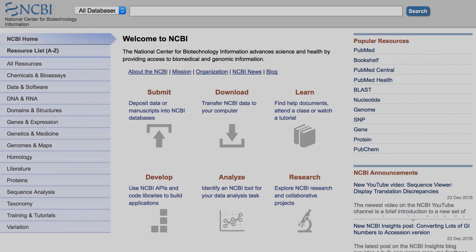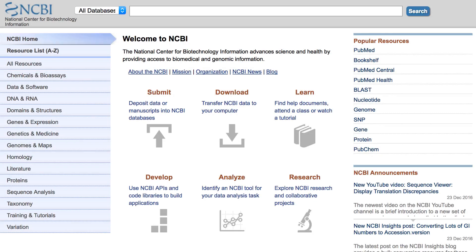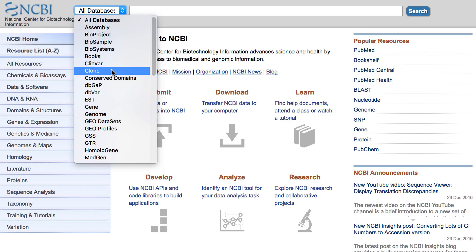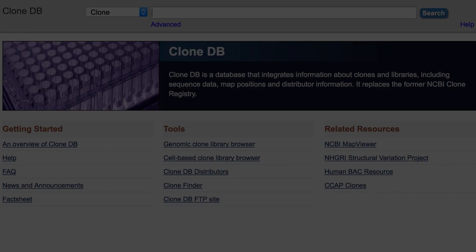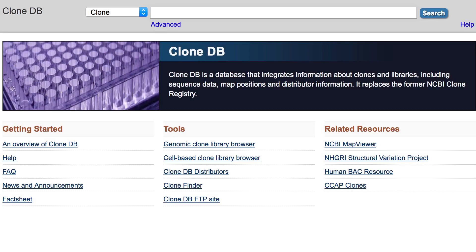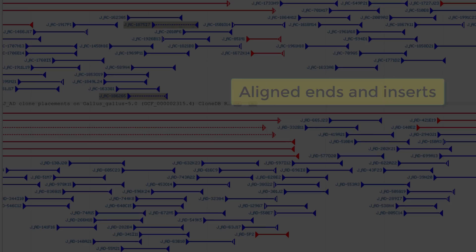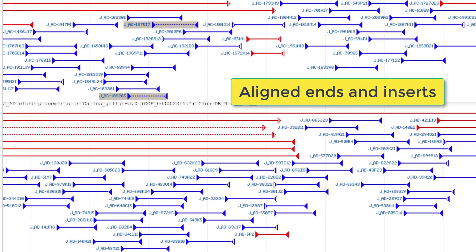I'll start on the NCBI homepage. To get to the CloneDB homepage, select Clone in the databases pull-down menu and click Search. If you want background on how CloneDB generates clone placements, see this FAQ. Very briefly, clone placements are created by aligning end and insert sequences on genome assemblies annotated at NCBI.